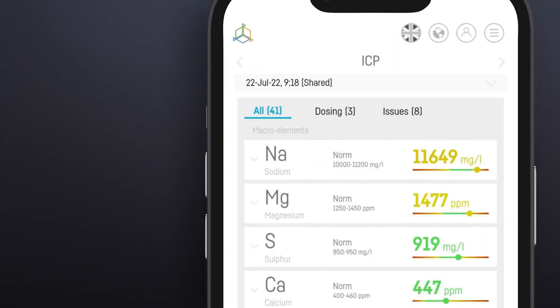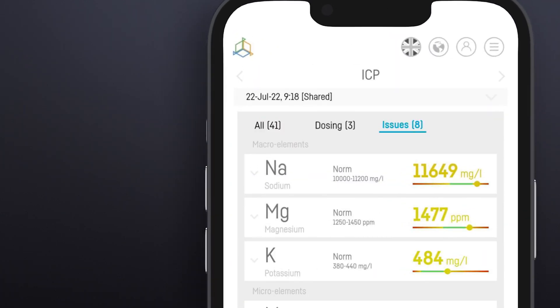When the results are ready, they are sent straight to the ICP tab in our Smart Reef app, or you can check them by logging in at reeffactory.com. In a simple way, we can access our ICP test results right here.